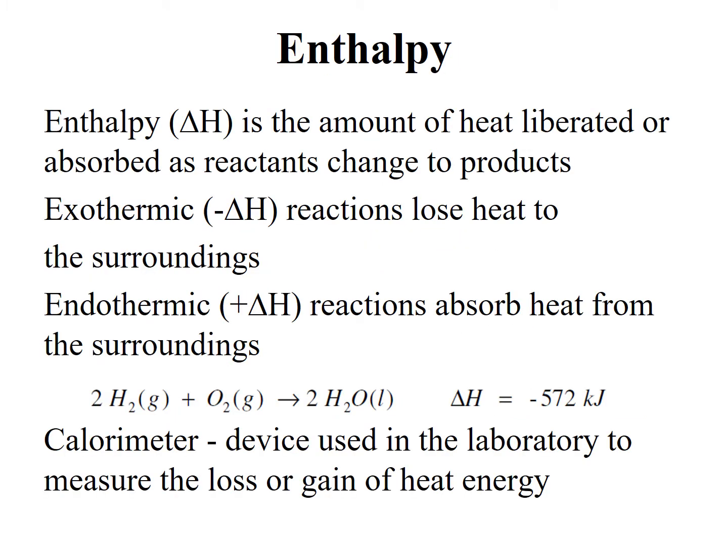In this experiment, we're going to look into the concept of enthalpy. Okay? So enthalpy is the amount of heat liberated or absorbed as reactants change to the products, and usually it is represented by the delta H sign.